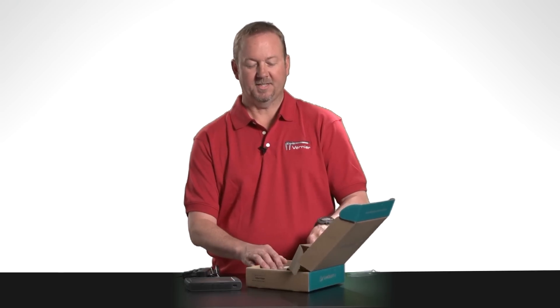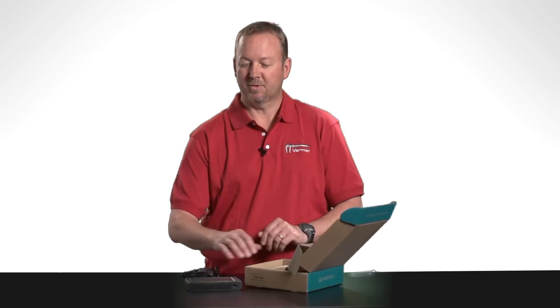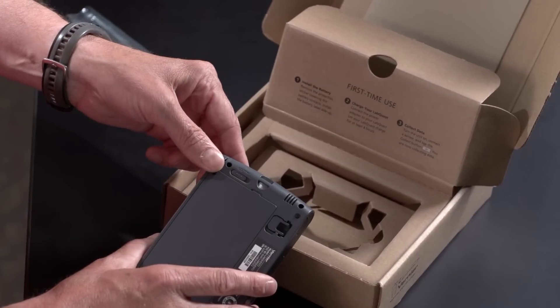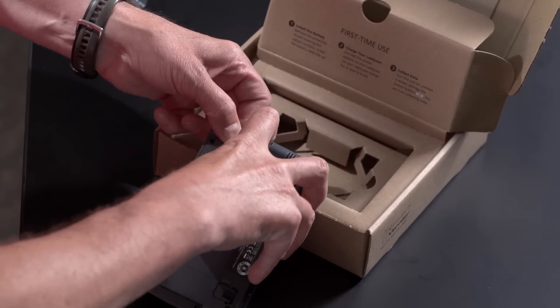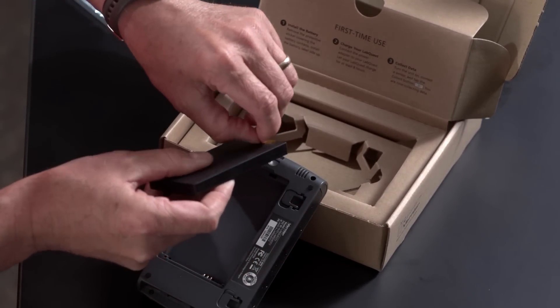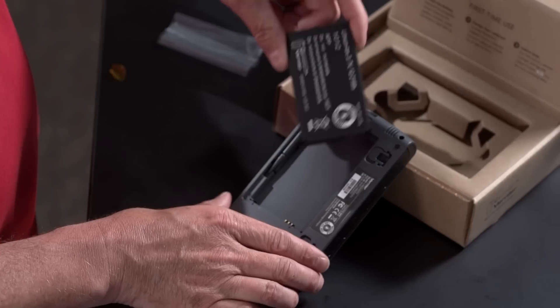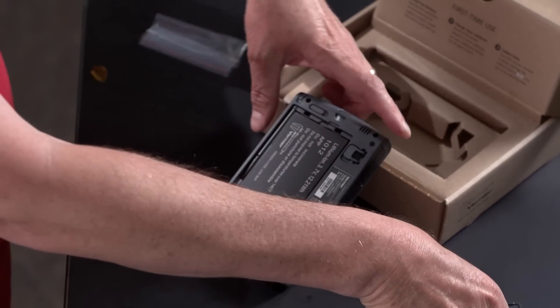Also printed on this are the first time use instructions. The first thing we must do is remove the protective tape from the battery contacts. So let's open up the battery compartment by sliding the battery latch to the right and removing the door. We can remove the battery, and here's the tape. So let's remove that tape, install the battery, put the battery in, and put the door back on.